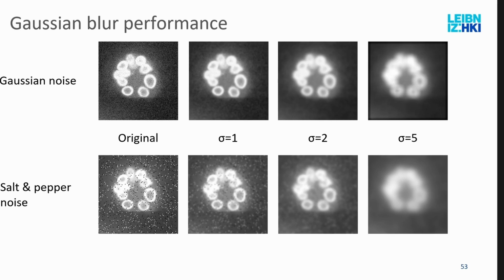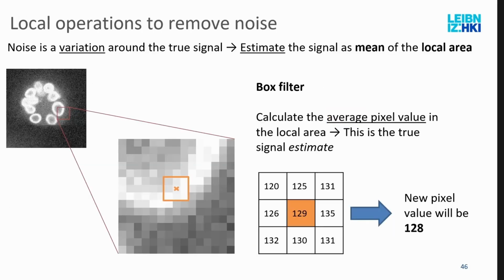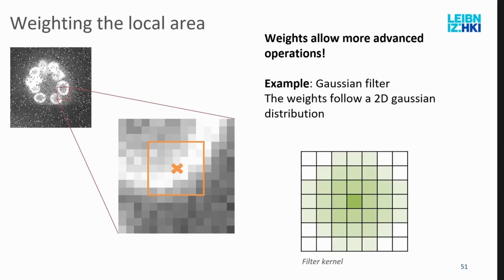And then one additional thing. Generally you would use the median filter where you need edge preservation, and instead of a box filter, you generally use the Gaussian filter, because it has better results. In the box filter, you sometimes get a blockiness. I don't see it here, but for larger images, sometimes you get some weird blockiness in the box filter. This comes from its mathematical roots being not completely correct.